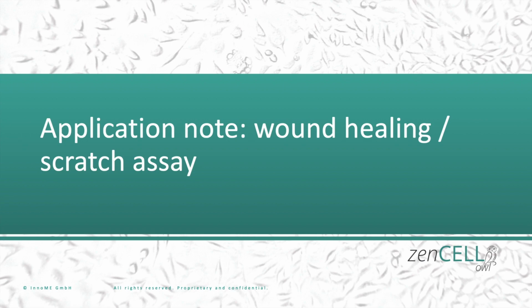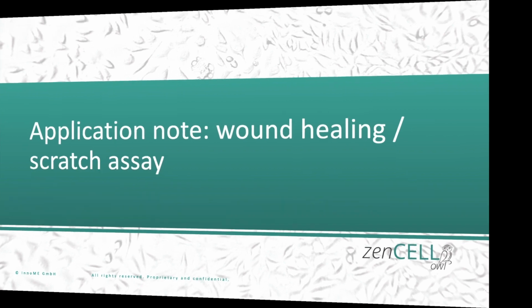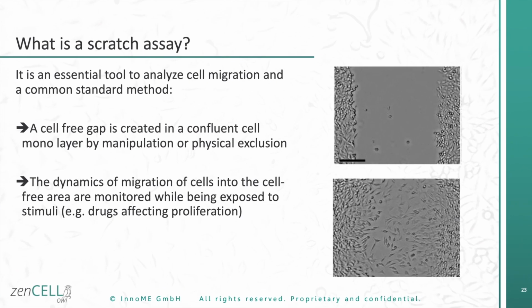Application note: wound healing or scratch assay. What is a scratch assay? It is an essential tool to analyze cell migration and already a common standard method in many cell culture laboratories worldwide. You're creating a cell-free gap in a confluent cell monolayer by manipulation or physical exclusion.